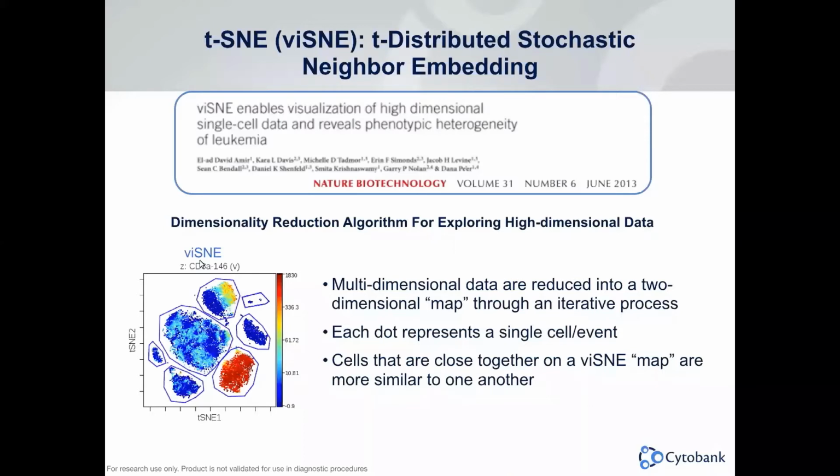In this case, the CD8 expression is observed within the group of cells. The expression level is color-coded, making it easier for scientists not only to visualize and identify interesting and rare biological subsets, but also to gauge those single-cell events across different samples.